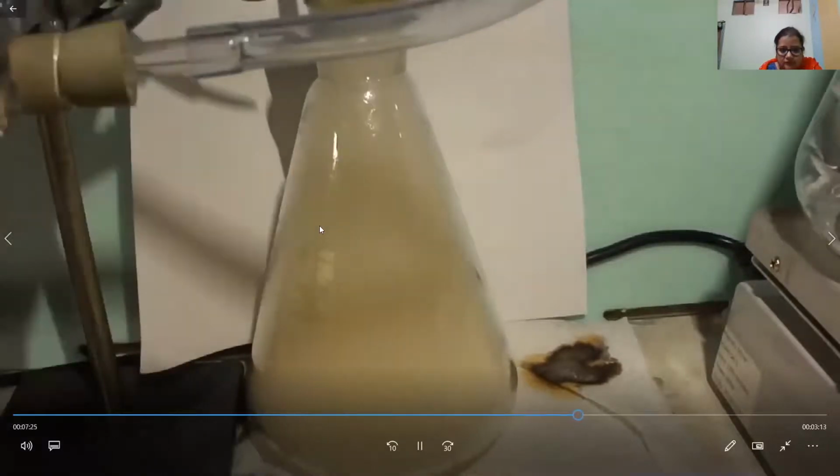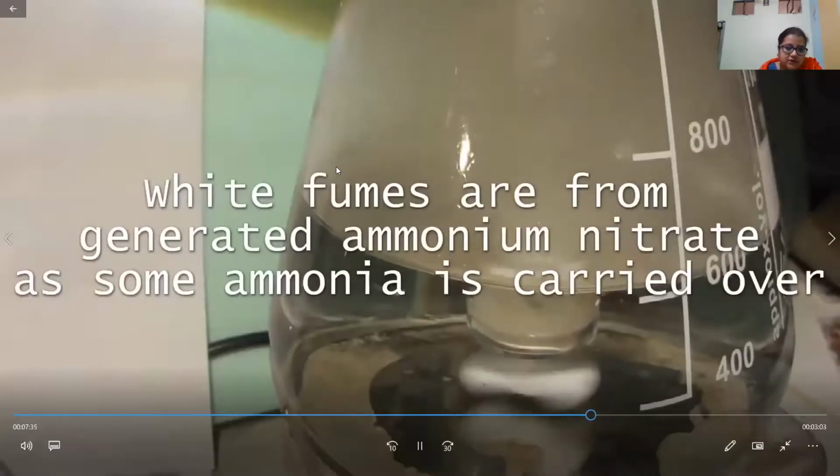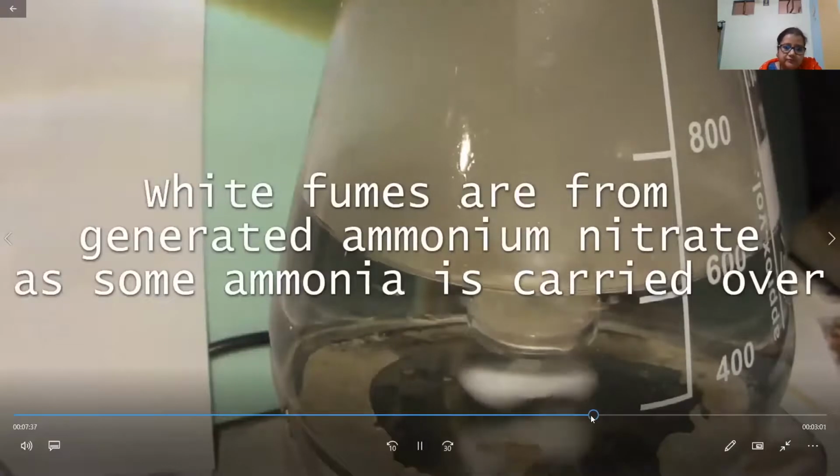Look closely now, you'll see brown clouds of nitrogen dioxide appearing in the suck-back prevention flask. We let the apparatus run for a while in order to generate the nitric acid in the gas washing bottle. Here we are a few minutes into the reaction. We switch off the airflow now.